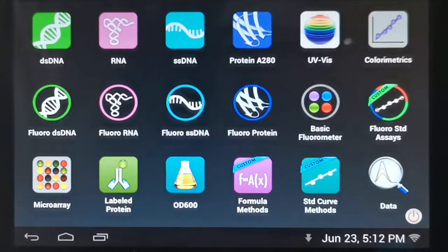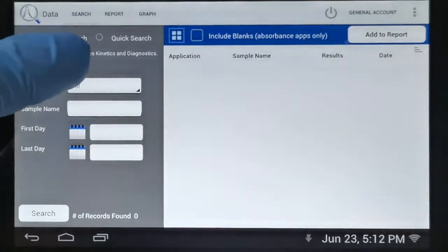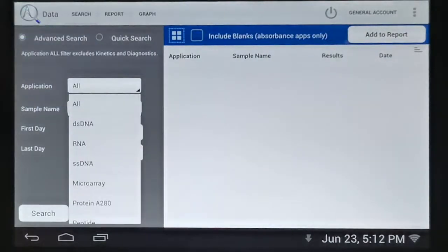Another feature of the DS-11 series is that whenever data is captured in any of our measurement apps, it's automatically saved, and this data can be accessed from the Data app on the home screen. We can see when we come into the Data app that we have a number of ways of searching our data on the left-hand side.